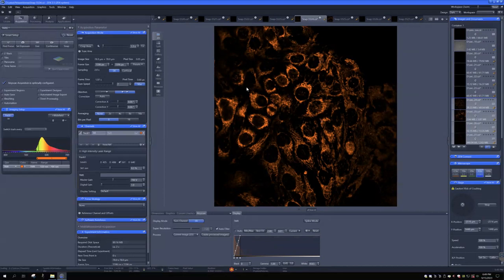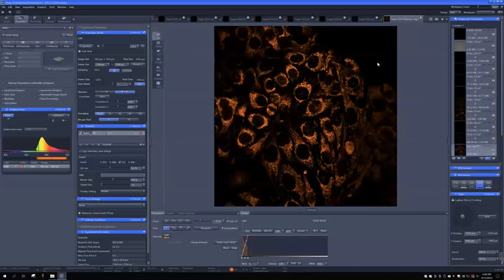This is the raw file we have. It's going to be .czi, but we need to do the super resolution process first. So we will use the default auto filter. It will calculate the best for you. You just need to create processed images, and then it will create a processed one for you.